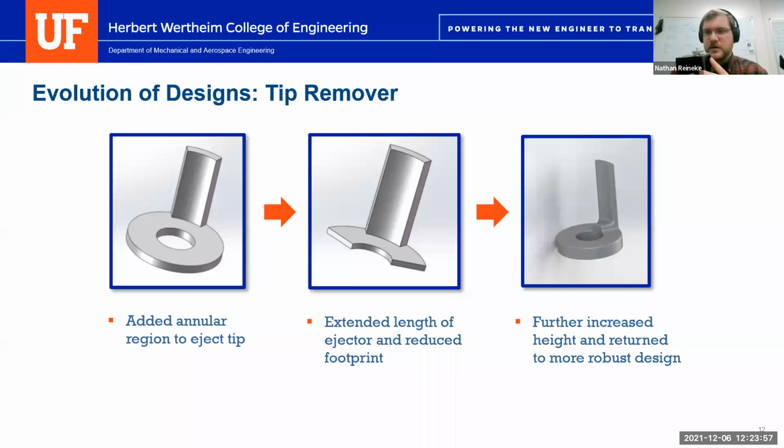Yeah, we actually gave it. So I have the model in my hand. It keeps itself constrained because we made the collar on the receiver tube a little bit bigger than was absolutely necessary. It gives it a little bit of boundary of error, which the 3D printer is able to meet every time. I've printed about 10 of these actually at various heights when I was trying to fully calibrate it. And I never had an issue where it was out of alignment, which I think that's what you're mostly getting at, is getting out of alignment and being either too big or too small to accurately fit within the housing unit where it interferes.